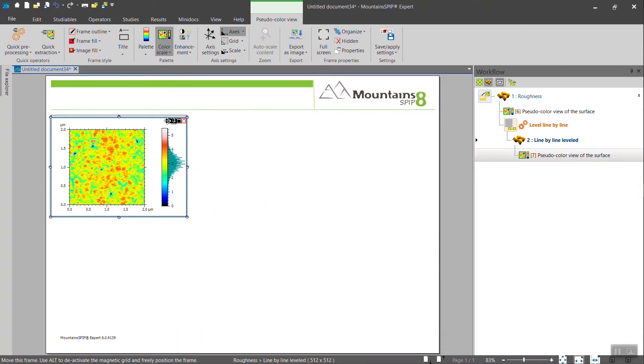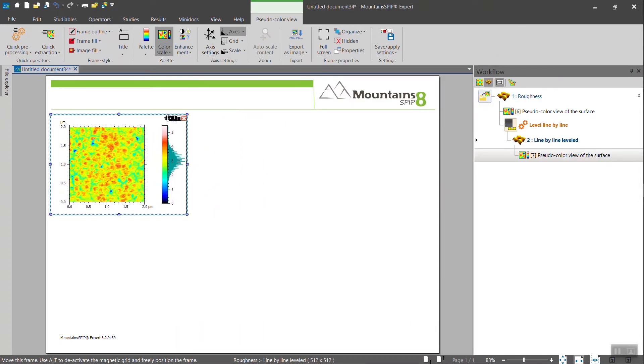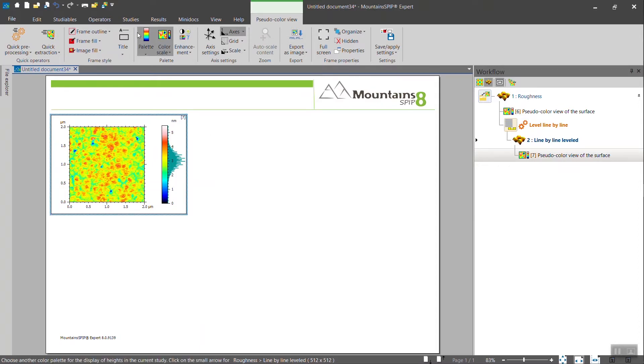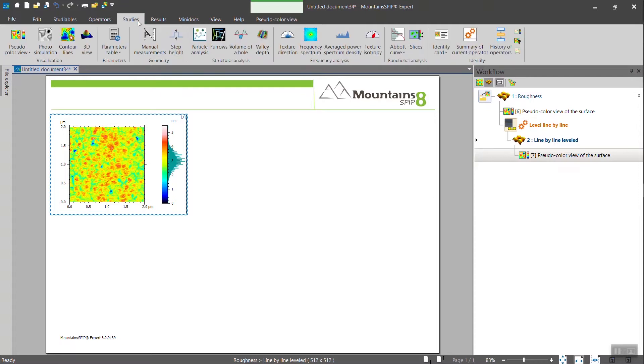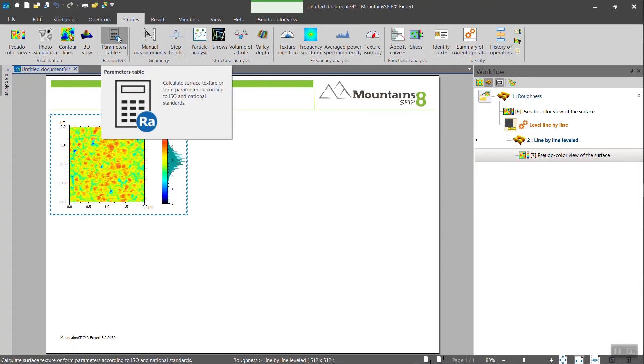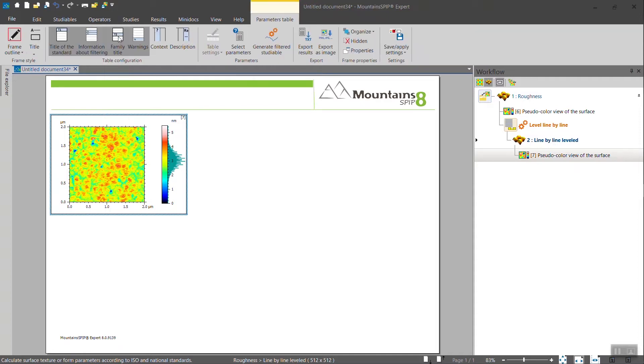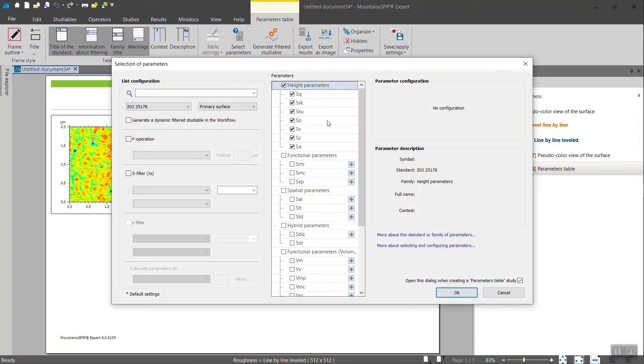Roughness parameters or any surface texture parameters in Mountains software you will find under the parameters table. When you select it, you will find a choice of parameters available.